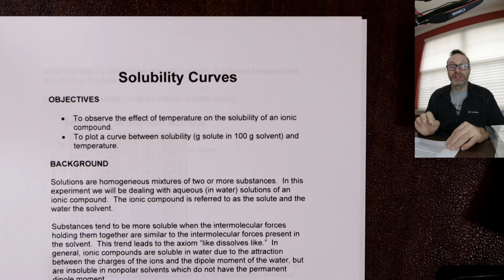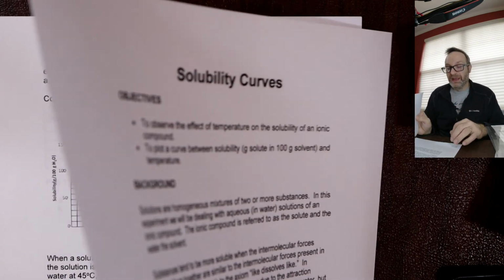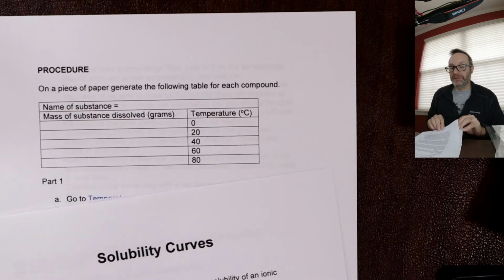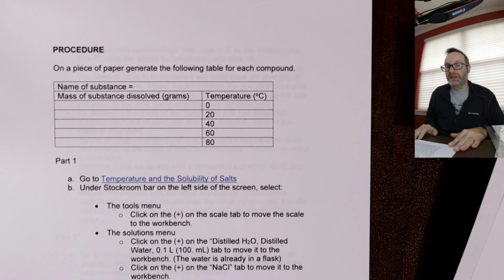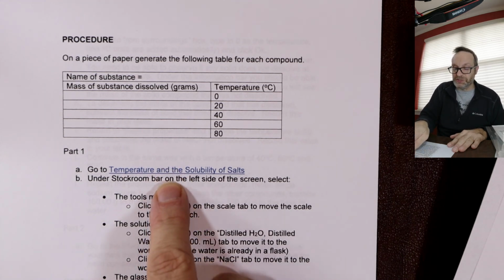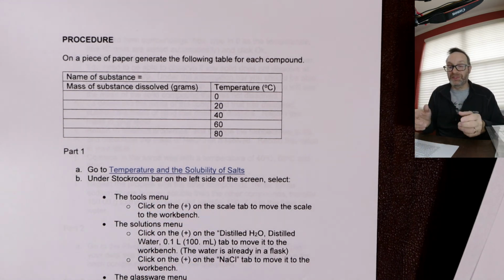This semester, most of the labs, you'll actually complete them at Pivot, and then I get on there as a grader and I just grade them on Pivot. So it's actually easier for me, right? But to be honest, one way or the other doesn't matter. But okay, you can read through, and it talks about literally what I've just been talking about. This can be done, you can either print it or just fill it out online. And then, you actually go to a virtual lab and start adding solutions.